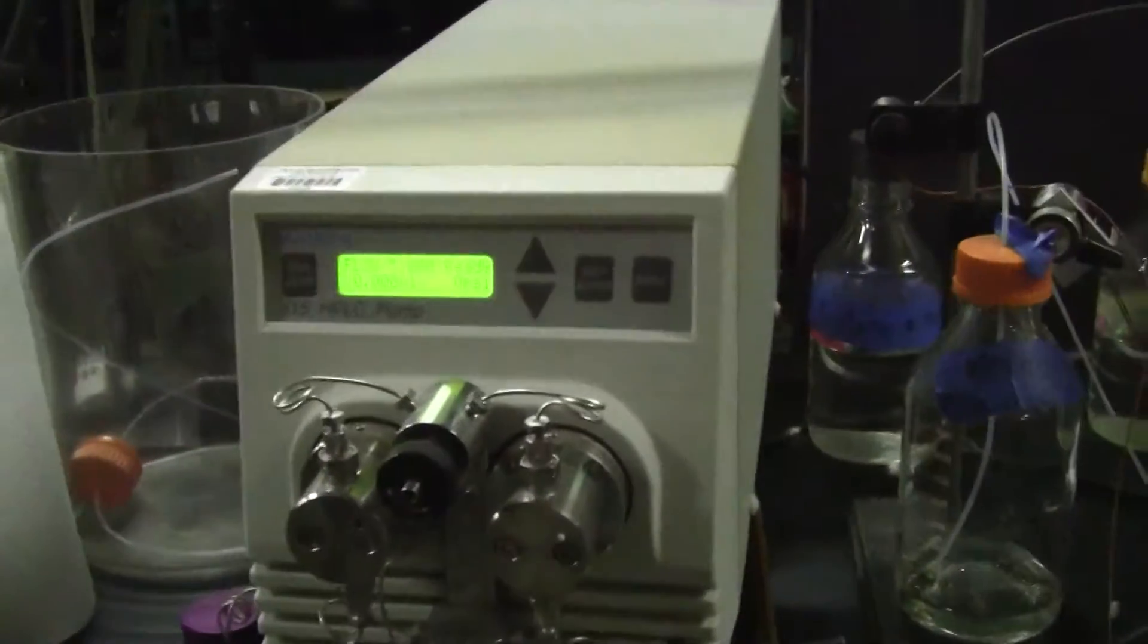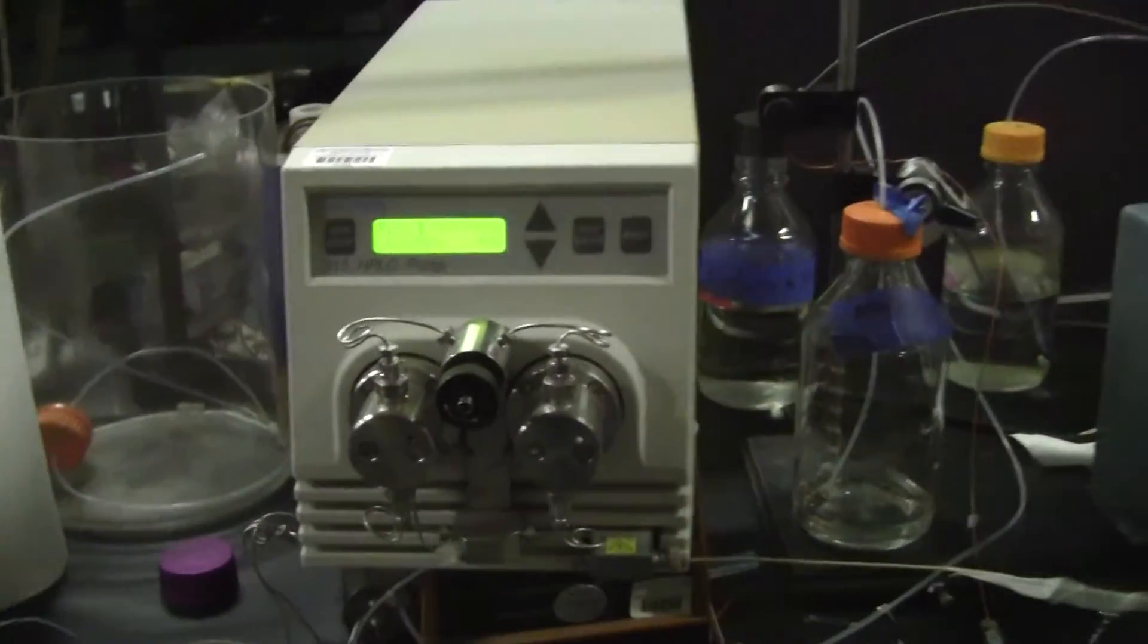Hi, this is Michael from Hitech Trader. Today we're looking at the Waters 515 HPLC pump. This is a very versatile pump.